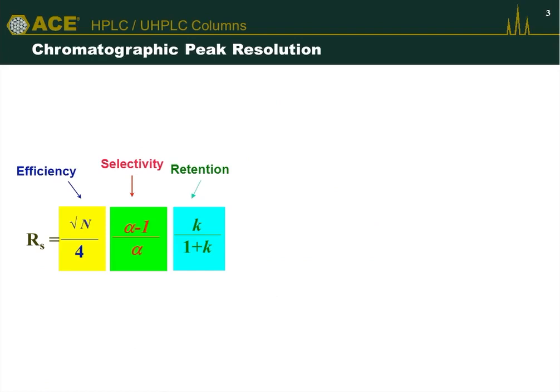This is one of the most important equations in chromatography, the resolution equation. This equation can help us as chromatographers when we are developing our methods or screening our samples. Resolution is important. This is why, as chromatographers, we support many colleagues in formulation, chemistry, and many other fields. Many people give us samples and they want to understand what's in those samples, and they also want to normally understand how much of those different things are in those samples. Resolution is therefore very important.